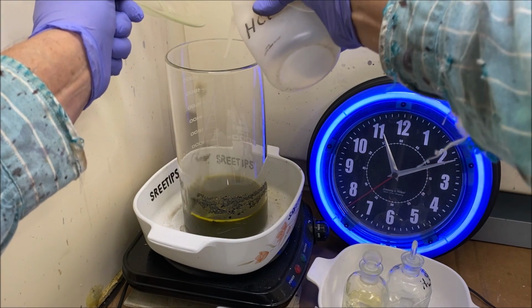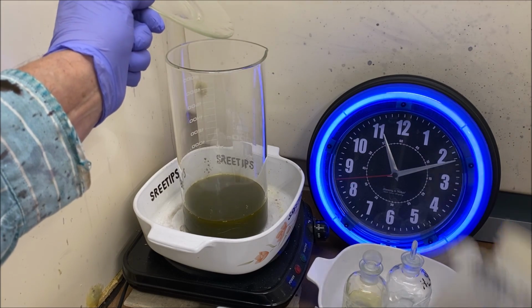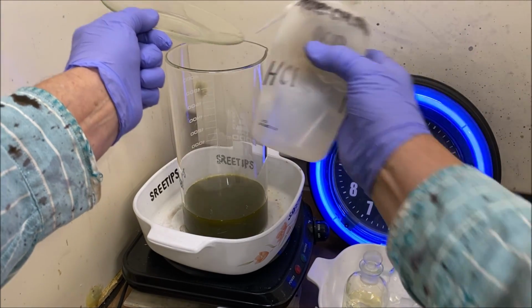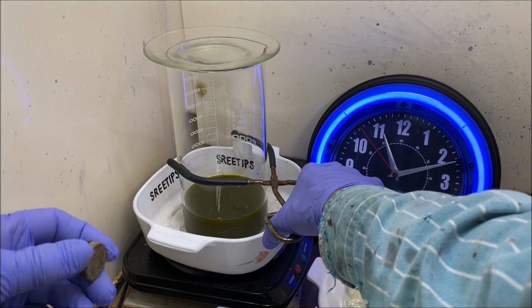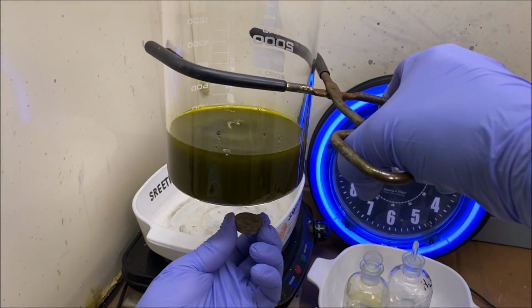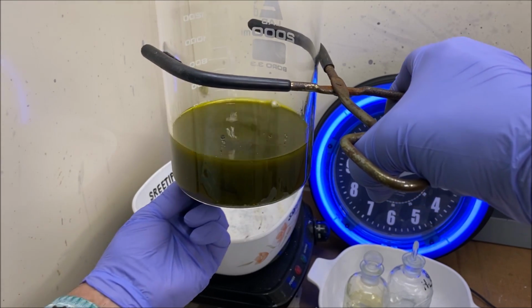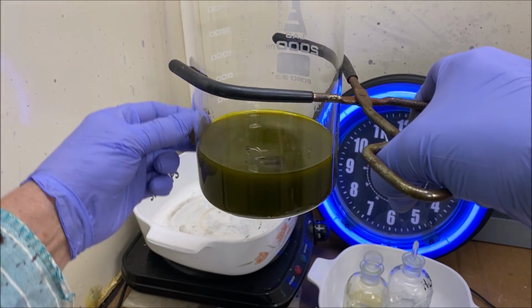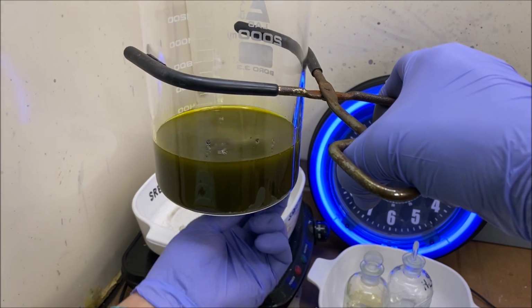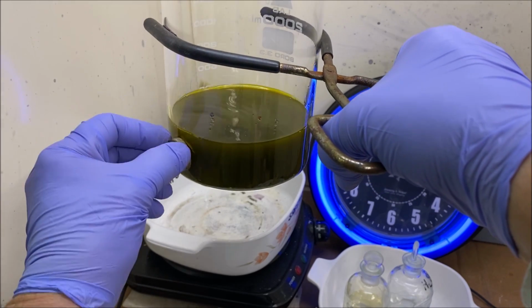This is my hydrochloric acid. I forgot to tighten the lid. And what we're going to do now is I've got a magnet, and we're going to check this. Run a magnet down here to see if we got anything magnetic. I do see some movement in there. No, I don't see it. There it is right there. What is that? There it is.